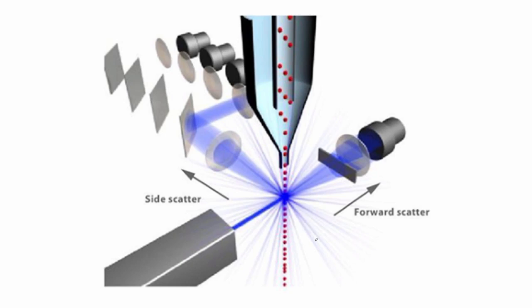Now we move to another aspect of flow cytometry, the optics. The optics of a flow cytometer is a system of lenses, mirrors, filters that direct light of a particular wavelength to a designated detector. For example, if we want this blue light to be measured on detector number 4, we will set up filters, lenses, and mirrors that direct blue light to that detector only.